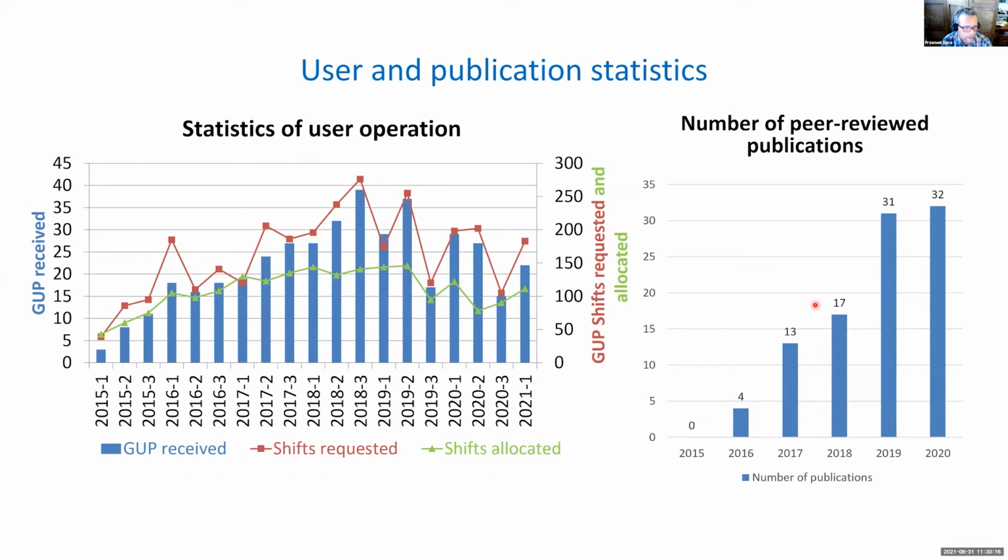Again, since 2015, we have grown this program and made the instrument reliable and pretty easy to use. So we see a steady increase in requests for beam time and increasing number of experiments. This was obviously affected by the pandemics and by some of the changes in APS regulations regarding access of users from certain countries, but we still maintain a fairly heavy demand for beam time, and you can see the oversubscription rate. It's not quite as high as what Quentin was showing, but this is because the source in our experimental station is bending magnet, so it's much lower intensity. It's very difficult to perform multi-megabar experiments with bending magnet beam.